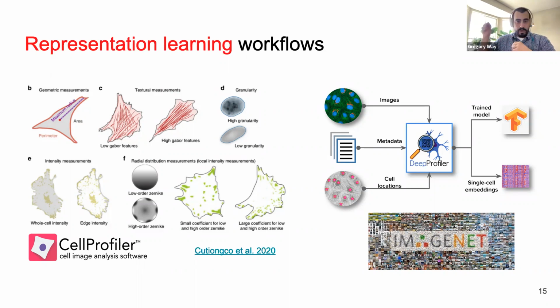I will talk about one example later where we have multiple cell types and machine learning models that are trained to predict different higher order phenotypes like DNA damage. If you apply those models to different cell types, in a lot of cases, they translate. So I think that's evidence that the features are more or less consistent, at least some of them.